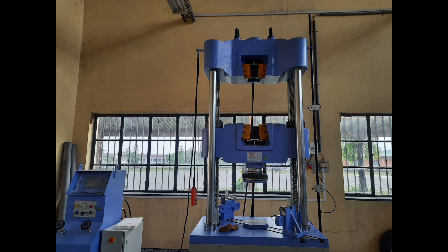The UTM can perform a variety of tests, including tension, compression, bending, bolt test, shear test, and transfers, making it a versatile tool in fields such as engineering and material science.